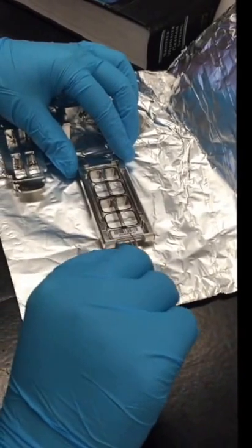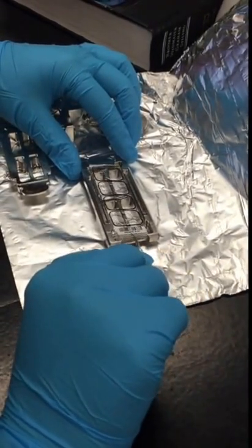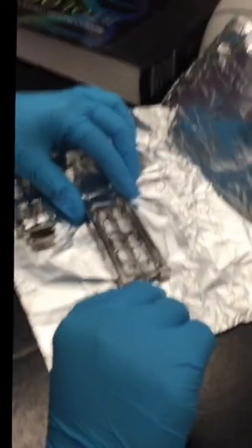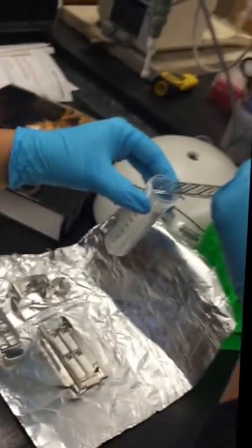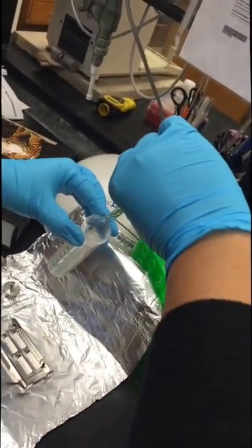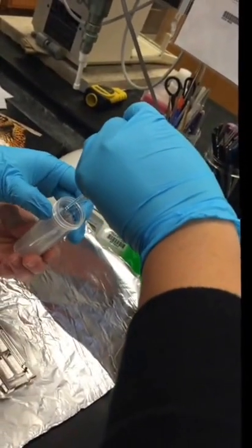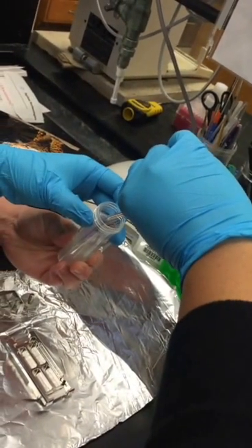That looks good, the seal looks good. I'm just going to open it. See if you can pop it open.